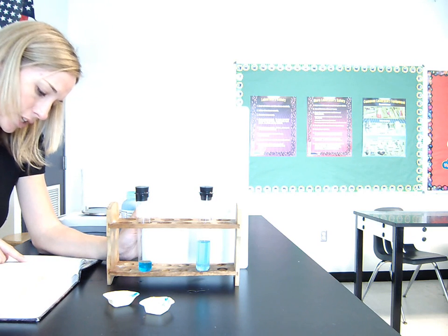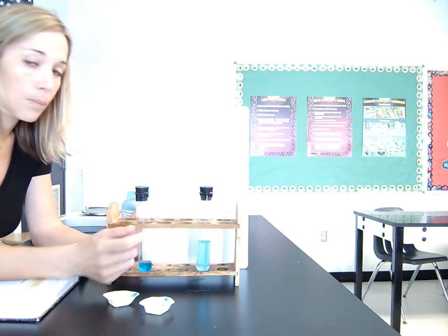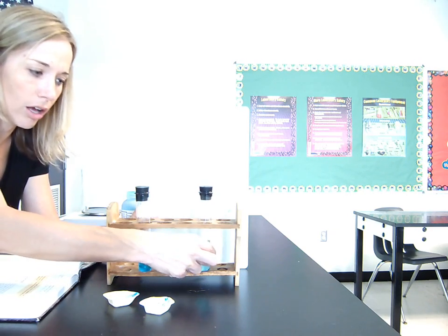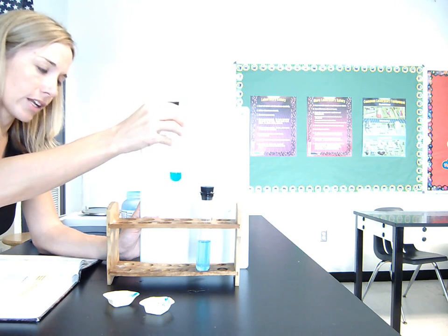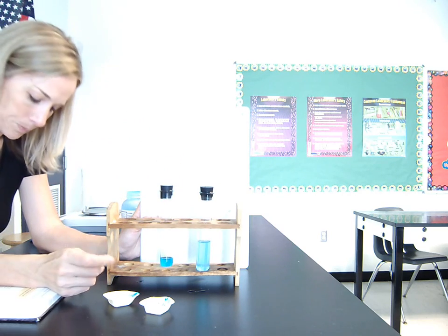Okay, so that's what that question is saying. Do you think that each cubic centimeter in one test tube contains the same amount of dissolved material? The answer is yes. It should include the same amount of dissolved material no matter which portion of this test tube I look at. Now, same thing here. Every portion of this test tube also, compared to itself, should have the same amount of dissolved material. So if I divide this one up in half, or in fourths, or eighths, whatever, every portion of this should have the same amount of dissolved material in it.